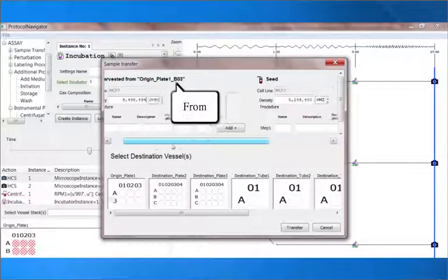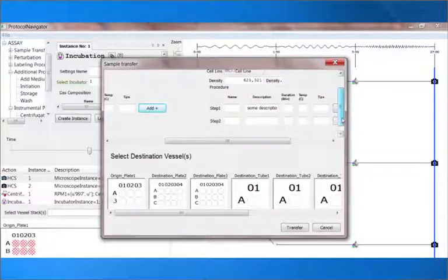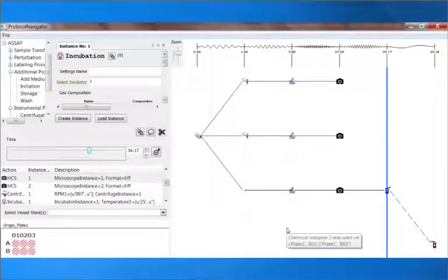During the transfer, scientists often do some intermediate steps like changing cell density. Here you can describe such steps through this expanding step descriptor. By selecting destination location, in this case a tube, complete the transfer. Such transfer can be done in any format, 1-to-1, 1-to-many, or many-to-1 location.